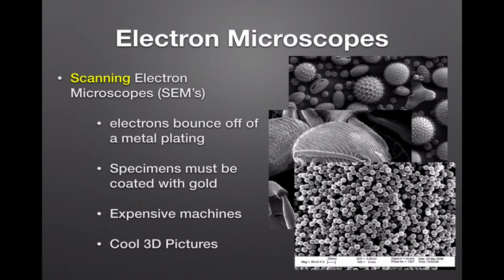And here's one of my favorites. These are Streptococcus bacteria. They are magnified 65,000 times, looking down here at the key at the bottom. Each of those little circles is a bacterium, one single prokaryote cell. Notice how you get a 3D effect though. Not a whole lot to see, just a whole lot of bacteria.